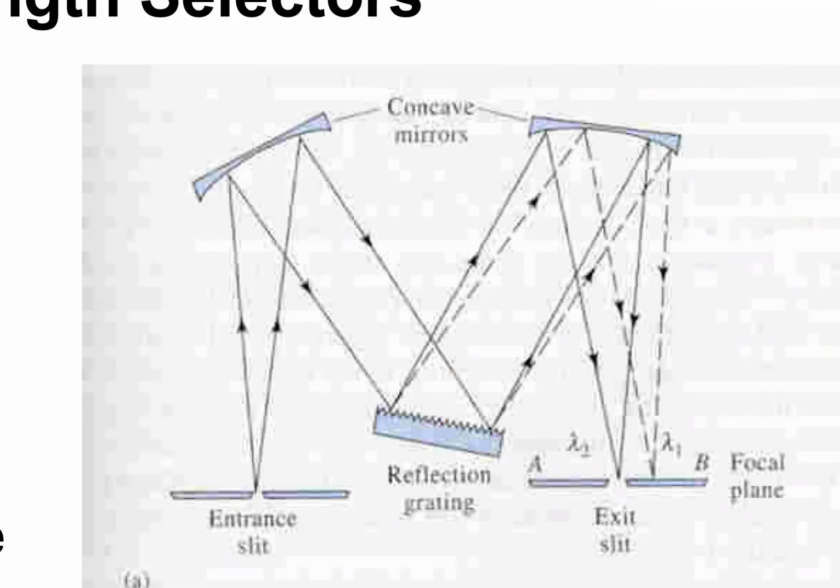Now, back in physics, chemistry, one of these STEM classes, you all probably have experienced an experiment that looks like this. It's called a double slit experiment, where you take a beam of light and you find it incident upon two slits, hence the name double slit, two small holes, kind of like these exit and entrance slits.